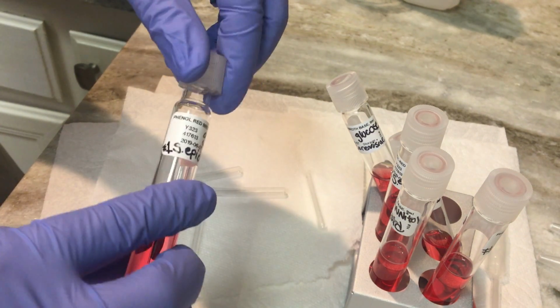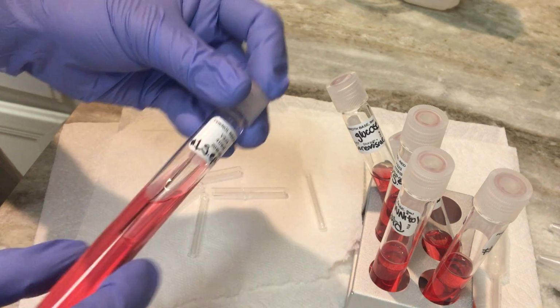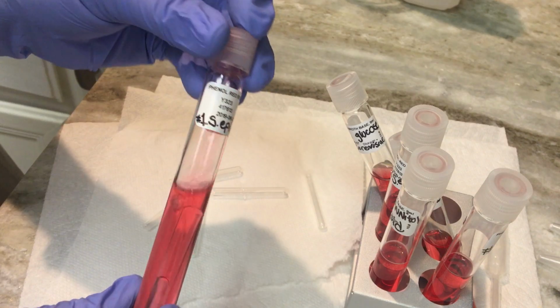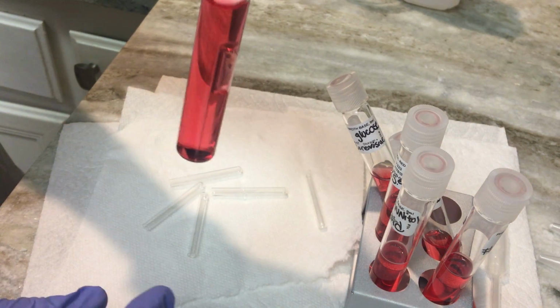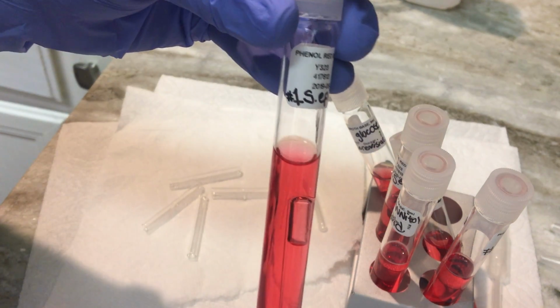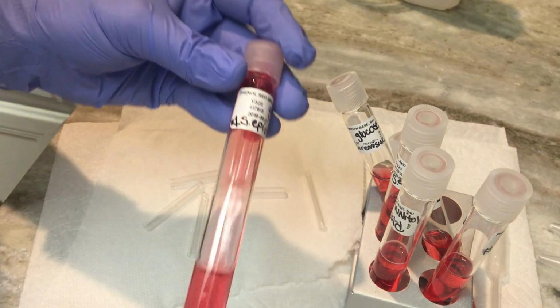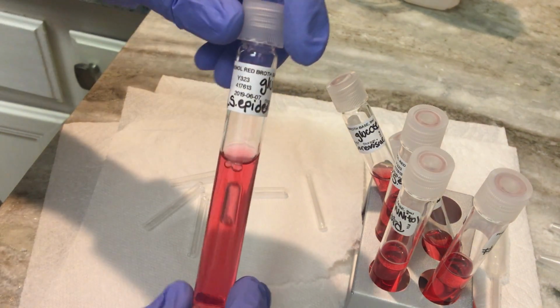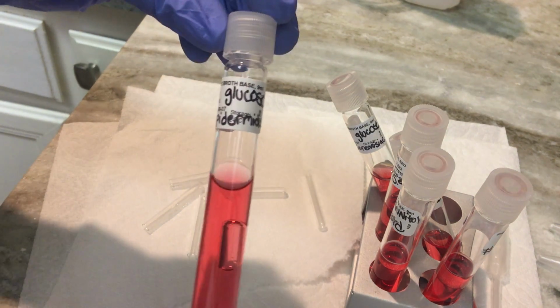So I'm going to close this, and to be honest, I had to practice this. I used a practice tube because I wanted to make sure I knew how to do it, and there's still a little bubble in there. Can you see that? So I'll just kind of play with this gently and get that bubble out, but I have to do this to all 6 of them.